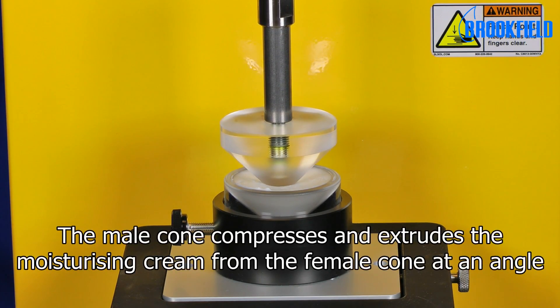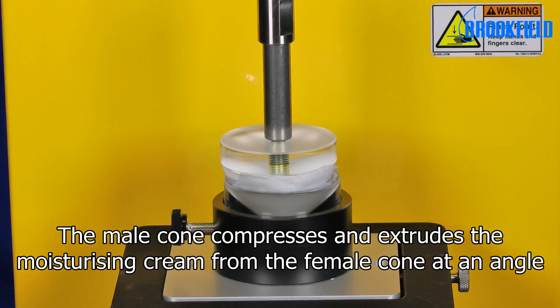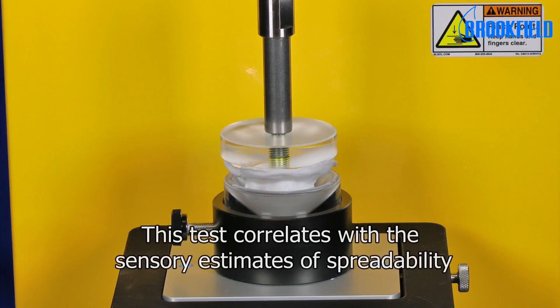Here the male cone compresses and extrudes the moisturizing cream from the female cone at an angle. This test correlates with the sensory estimates of spreadability.